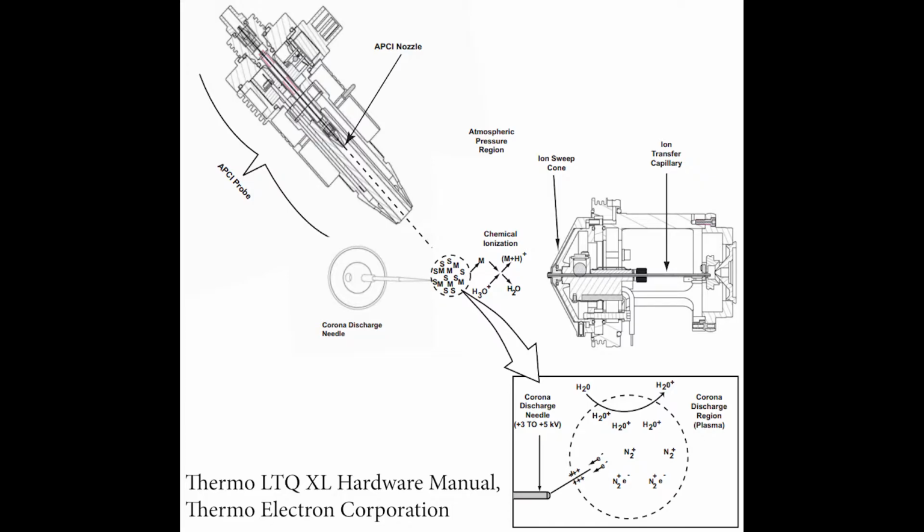Instead of applying the voltage to the needle where the sample is coming out, to the sample spray, so that we produce charged droplets, we're not going to produce charged droplets. We're just going to nebulize. We're just going to spray aerosols. Now, usually there's a heater there, so we spray the aerosols and usually heat them up a little bit. But then that needle is right there in the way of the aerosols, and it has a corona discharge. So it has a bunch of ions.